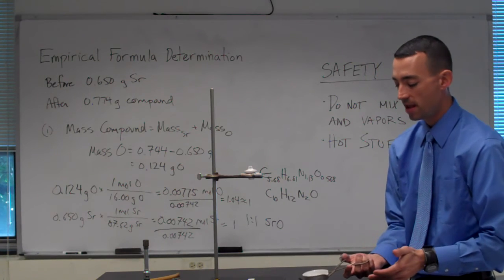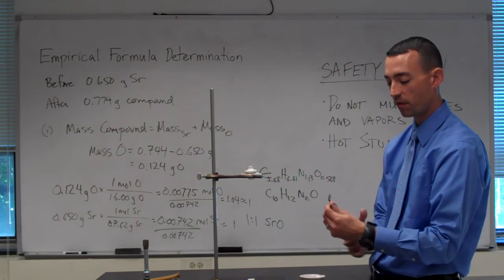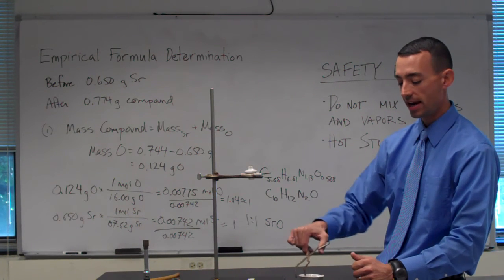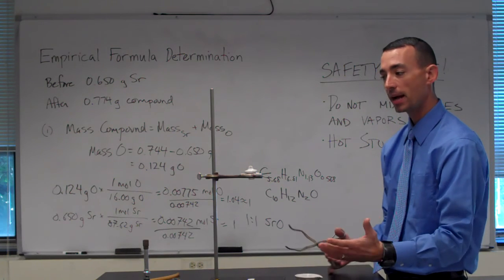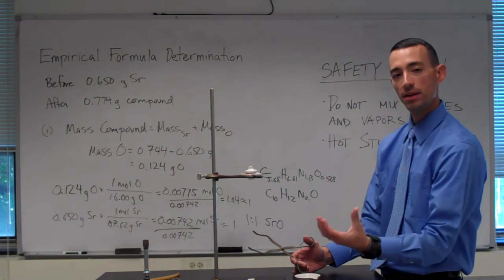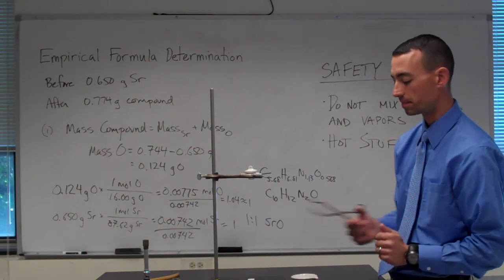You could try that, but you might want to practice before you begin. See? So you might want to practice before you begin the experiment as to how hard you can squeeze any one of these pieces of equipment and how you can safely hold it, whether you're more comfortable this way. As a backup, I don't have one here, you can use what we call a hot hands. It's a little rubber piece that you can stick your fingers into that you could hold underneath as a backup in case this should slip.